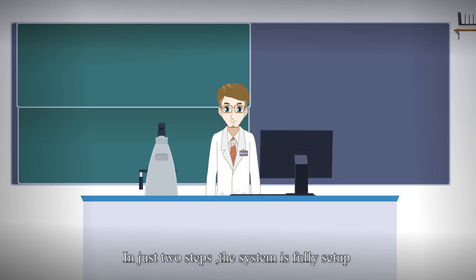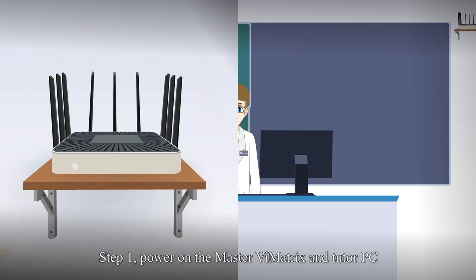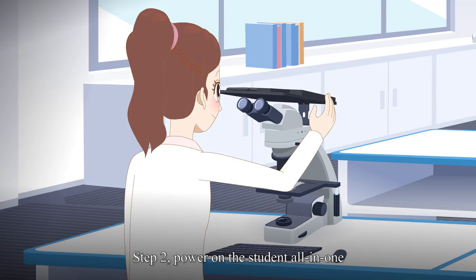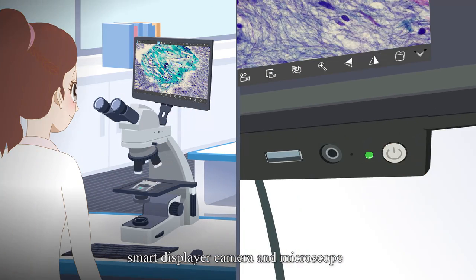In just two steps, the system is fully set up. Step 1, power on the master Vimatrix and tutor PC. Step 2, power on the student all-in-one smart displayer camera and microscope.